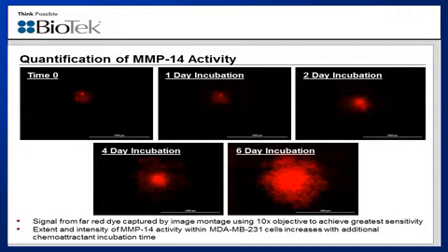However, since the invading tumoroid structure covers a large area of the well, as you've seen in the previous slide, multiple images were needed to capture the entire structure. We accomplished this by performing a montage imaging step and then automatically having the images stitched back together into the final pictures that you see here in the slide.